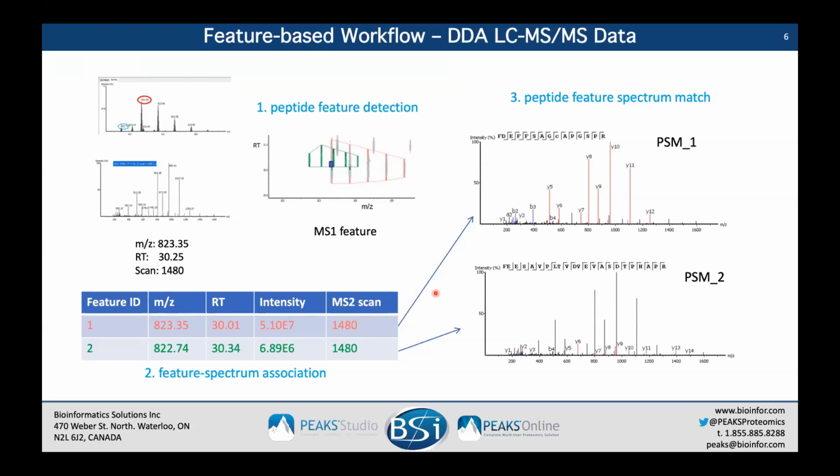And so what's happening is in the same MS2, we essentially have two peptides that are these features. And because the software has recognized that there should be two features in this MS2 scan, what we can actually do is use our combination of feature detection as well as de novo and database search to go through and actually annotate both the more abundant, in this case, red feature, as well as the lower abundant ion series that turns out to be the green feature.